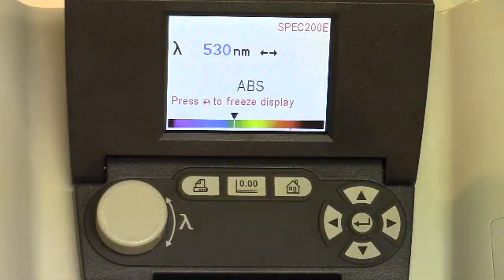All right, and so you'll use those values in this part to make a straight line plot. So you'll need to use a program to get you a straight line. And then you can use that to figure out the concentration of an unknown sample.